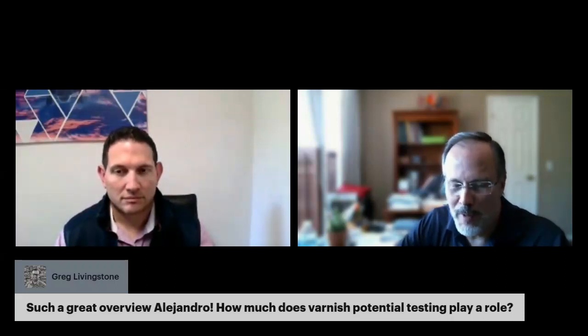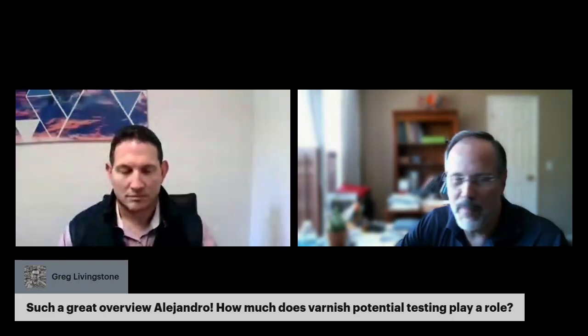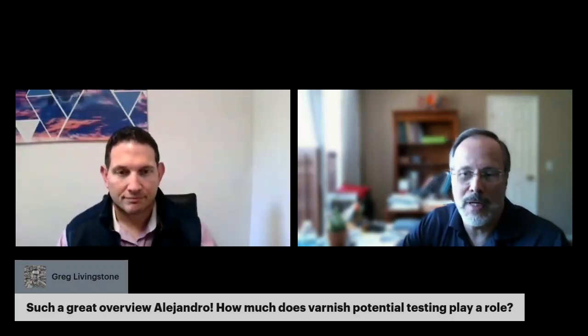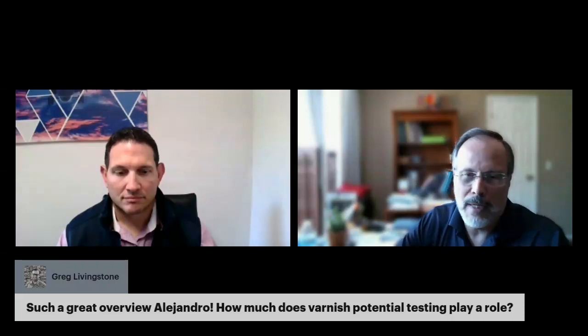Varnish potential should be part of our routine oil analysis in critical equipment, large machines like large circulation systems working at high temperatures, paper machines, turbine oils, critical compressors. It is a great resource for routine oil analysis in critical machines and large reservoirs where temperature may be a concern.